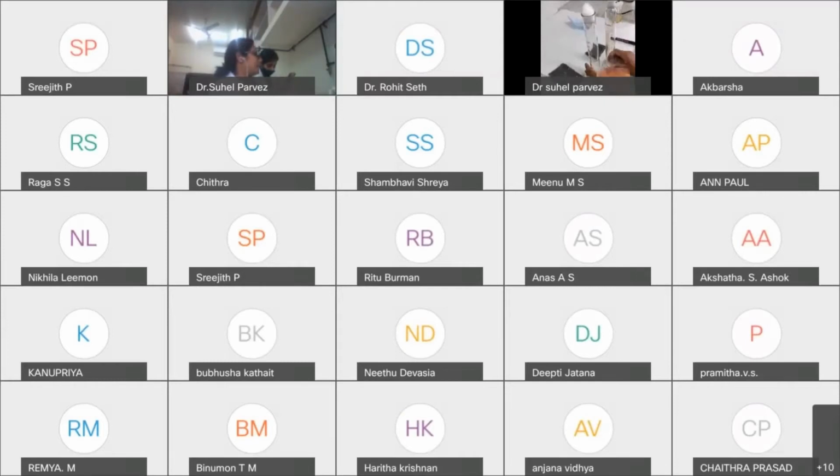Generally for the climbing assay, we use two tubes marked with a 10 centimeter mark. We tap the flies to the bottom of the tube. When we free the flies, they jump and climb upward. When we compare, the wild type fly goes rapidly upward within 10 seconds, while the diseased fly is not able to go upward within 10 seconds. I'm going to show you how it works. This is how we tap the fly. From this side the flies go rapidly. It's already on the top.